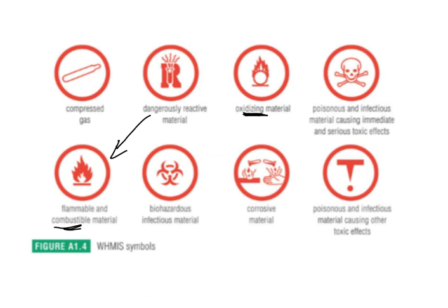Okay, everyone's seen the skull and crossbones, right? The classic pirate flag. It means it's poisonous and infectious. The flame, it's flammable and combustible. It can blow up. This one, most people have seen this one before, it's called the biohazard symbol, right? If there's something that's going to be like an airborne toxin, like biohazardous mold, and you have to drape the building off with plastic sheets around it because of that. Asbestos or anthrax, if you've heard of those, would be biohazardous.